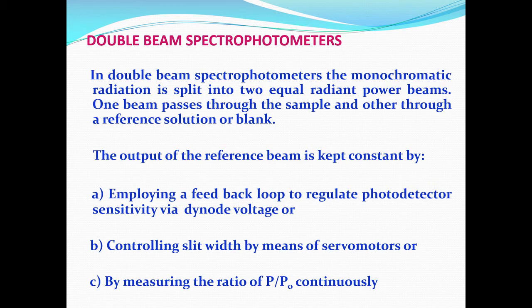The double beam instruments are the next higher end, which are the current state of affairs equipments. Their range varies from 4 to 5 lakhs to 15-20 lakhs. Some instruments I have seen even up to 80 lakhs, which can measure even very thin films of metals for reflectance, absorbance, etc.